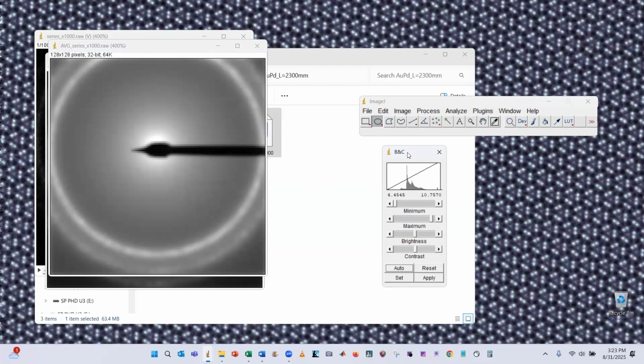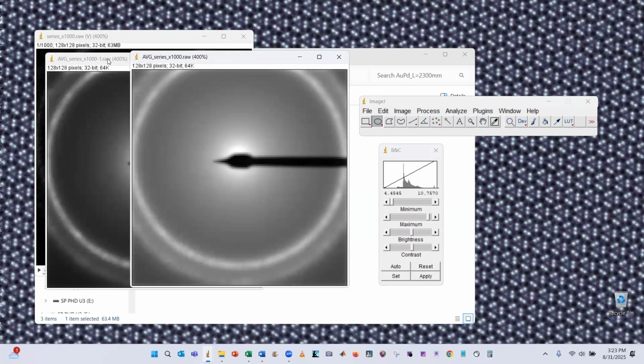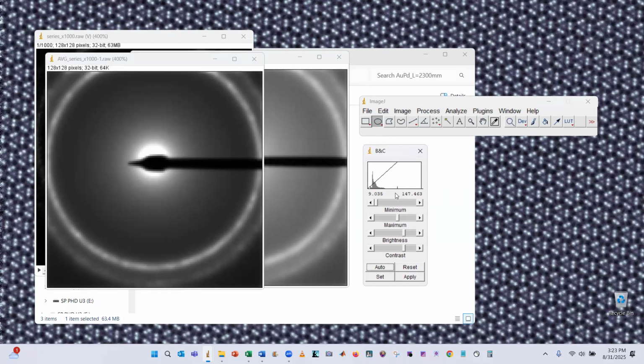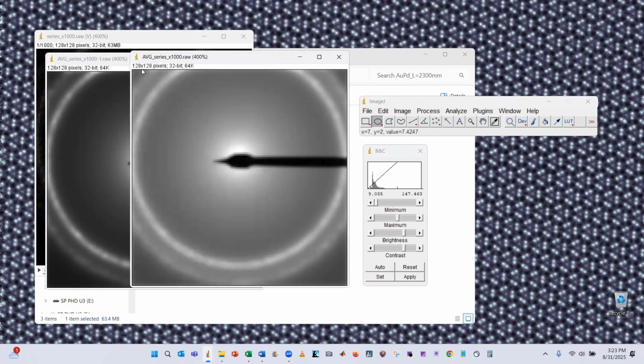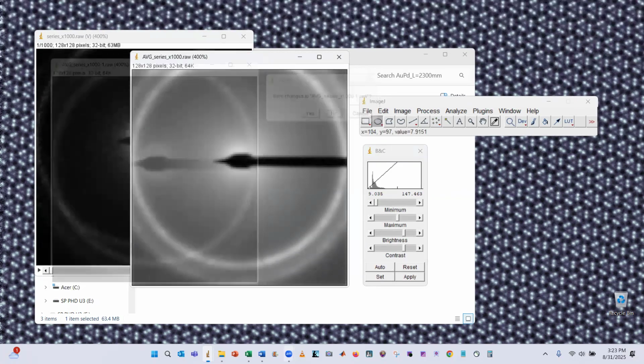You can see my dynamic range here is 10.75 to 4, so that's very easy to see with our eyes. If we look at the other one, this is a lot higher dynamic range, but this is still visible. So either one of these will work, to your preference. Let's go ahead and just use the log version here. I'm going to close that one.